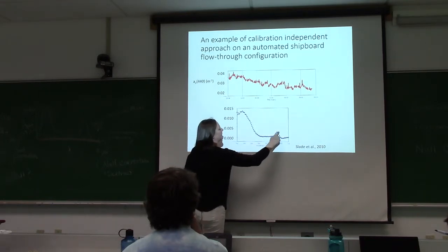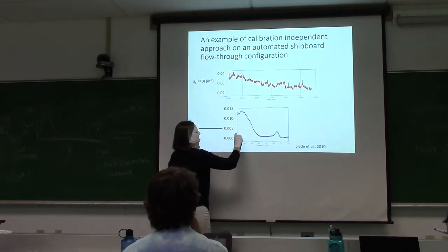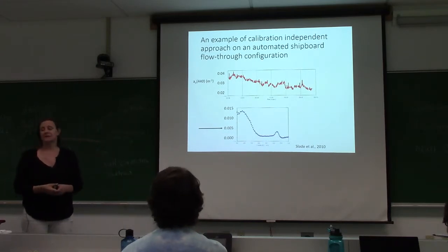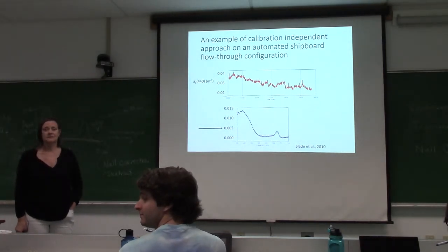And now we have basically an absorption peak here on the order of less than half of that uncertainty. So it's a really incredible approach. And you guys are going to do it in lab today and tomorrow. And so we hope to set up an inline system like this on the cruise in 3 weeks. So you'll get a perfect opportunity to see how this works.